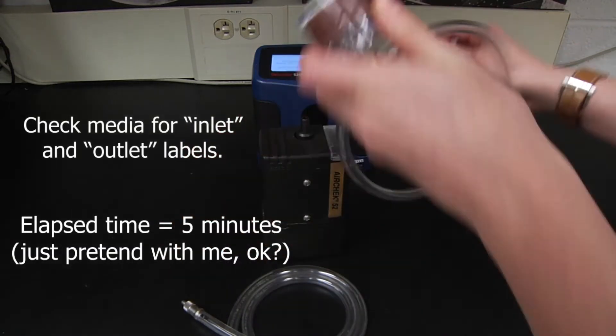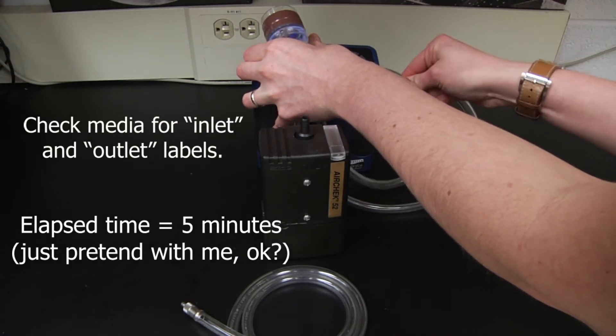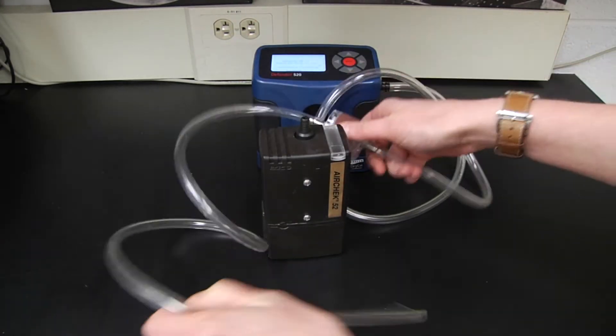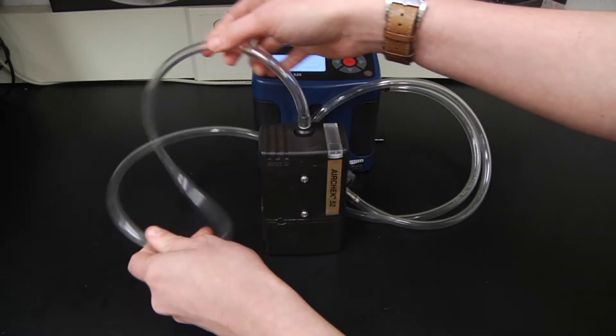Once your pump is sufficiently warmed up, align your sampling train so that your pump is sucking from the suction port of your electronic calibrator. Ensure that the pressure port is clear.